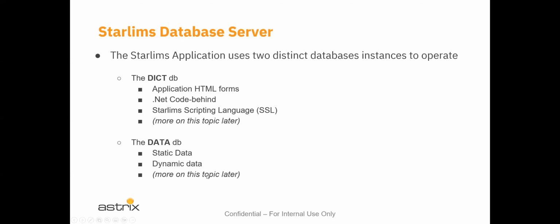So anything related to an accession, which is a reception of a sample to which tests are assigned, to which workflows are assigned, and to which those results associated with those tests and testing and sampling, that's all dynamic data in STARLIMS, and that's all hosted within the database. And we'll be talking a little bit more about that later too.